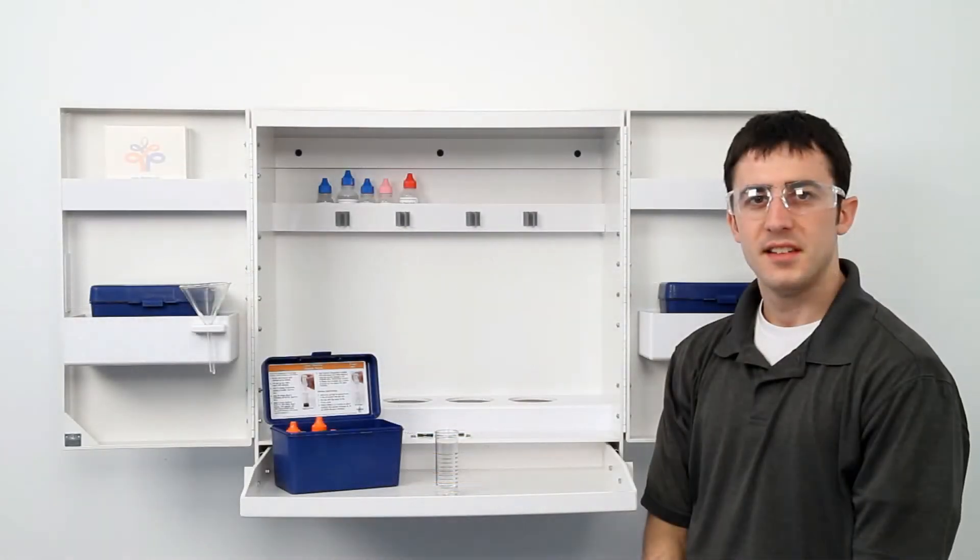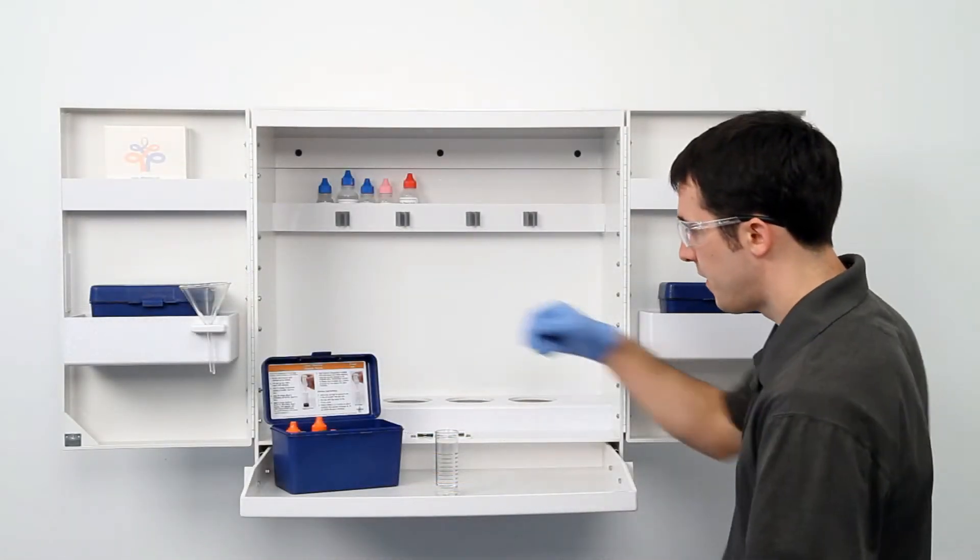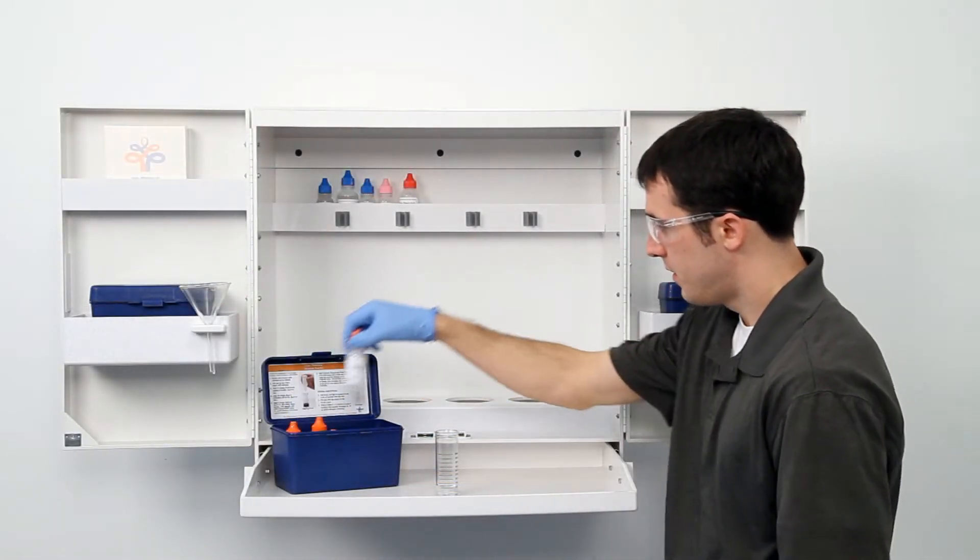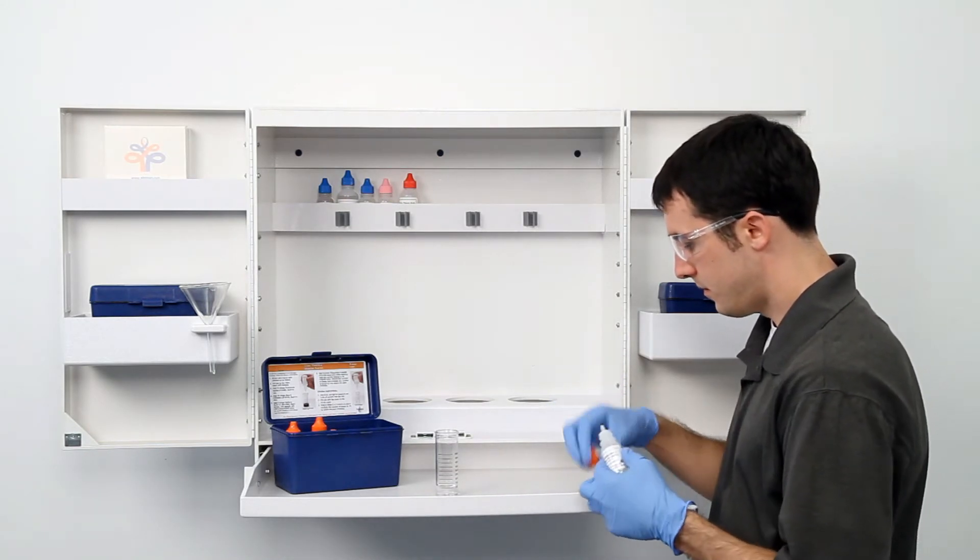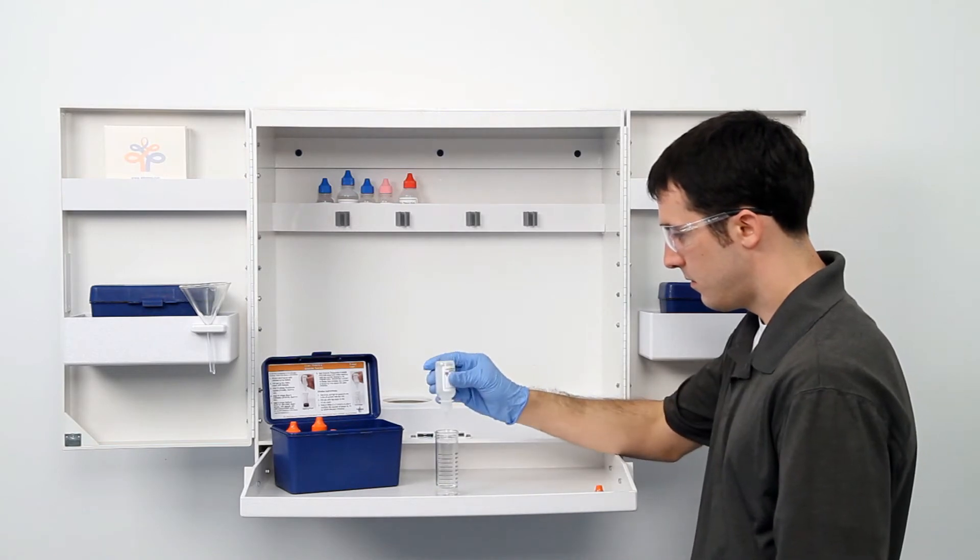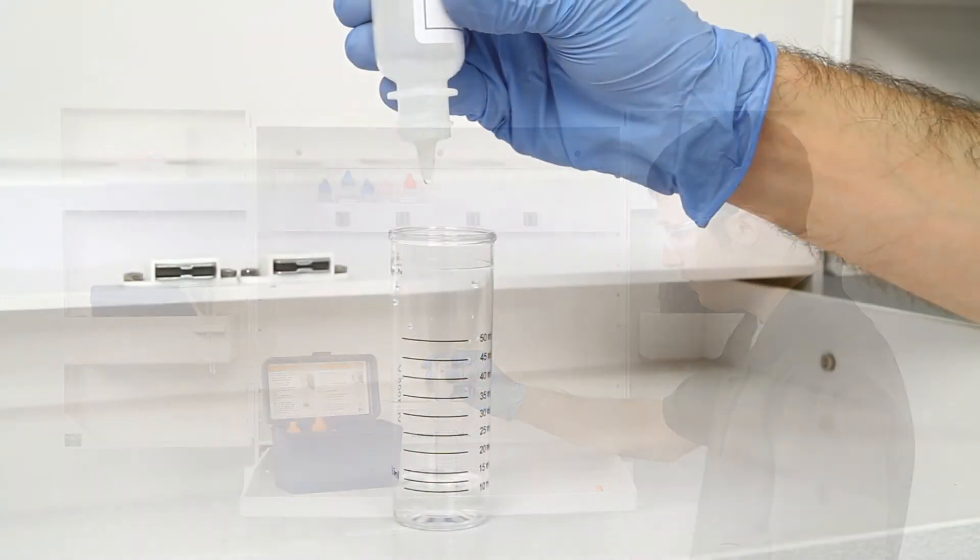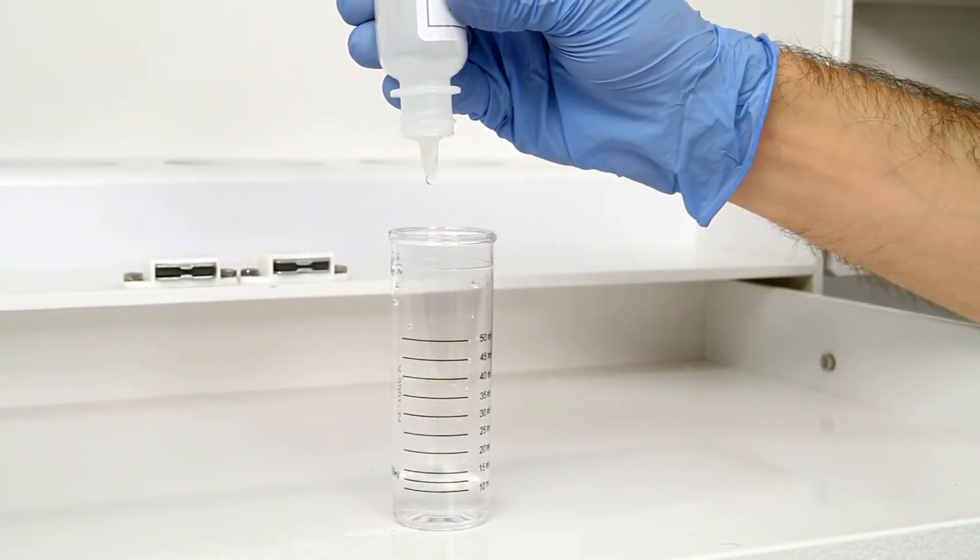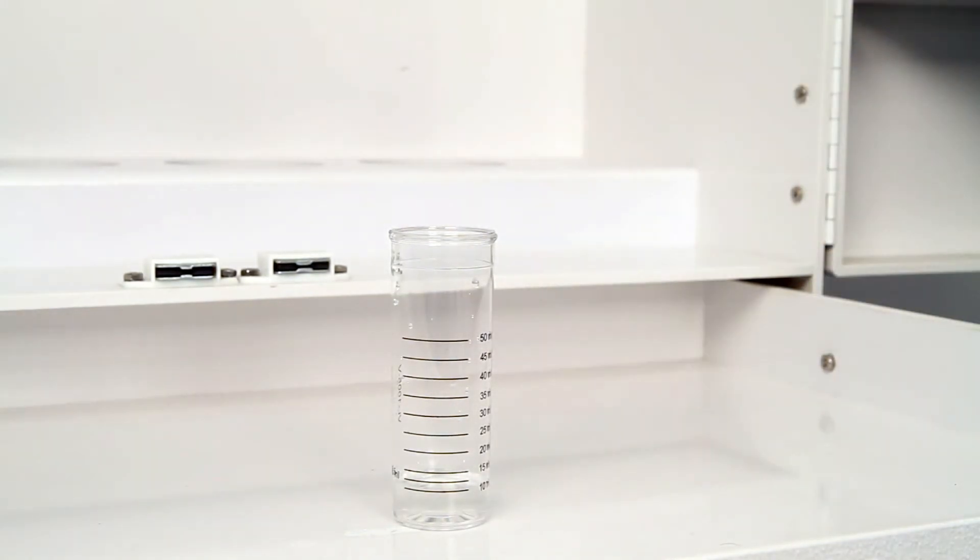The next step is to add five drops of starch indicator. Hold the bottle vertically and remember to swirl the vial for five seconds after the addition of each reagent. If the chlorine concentration is high, the sample may turn slightly blue-black at this point.